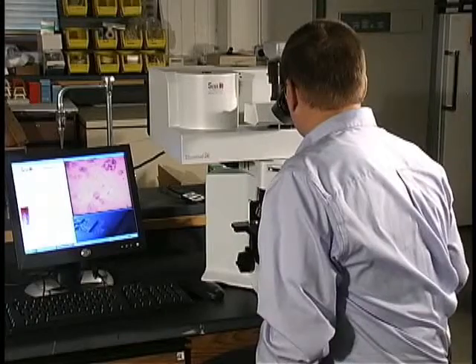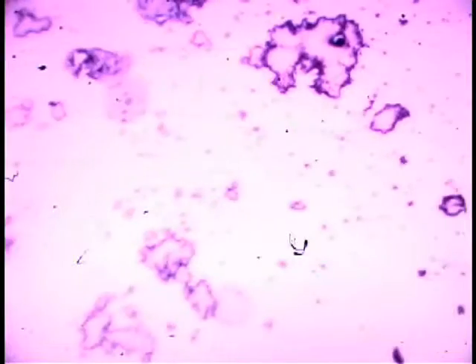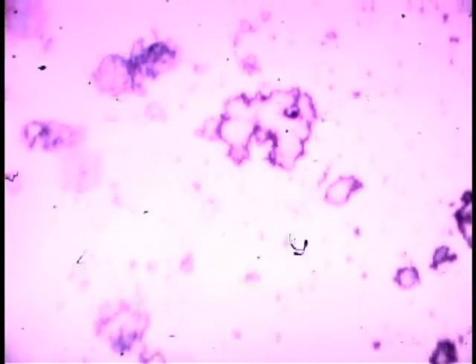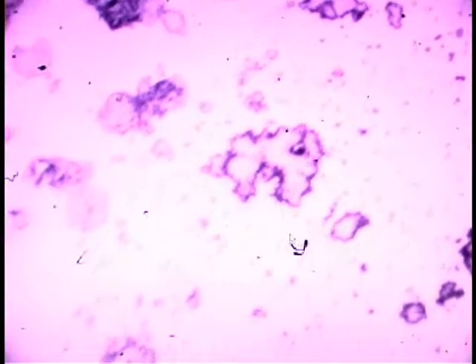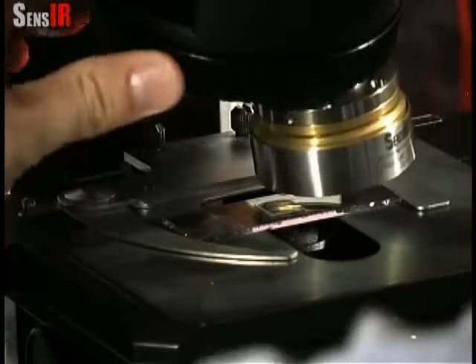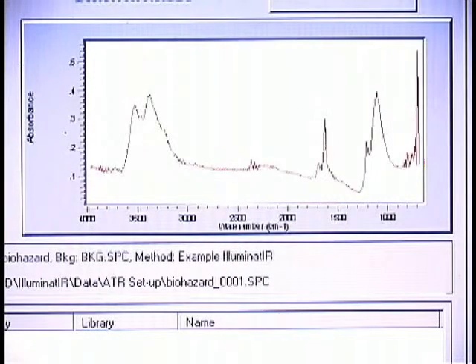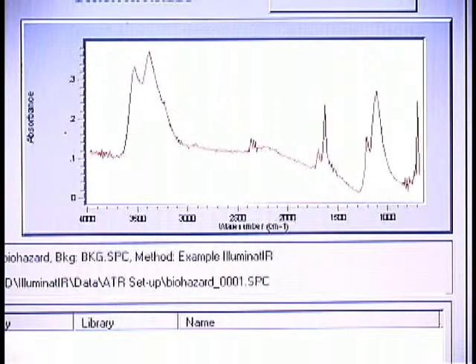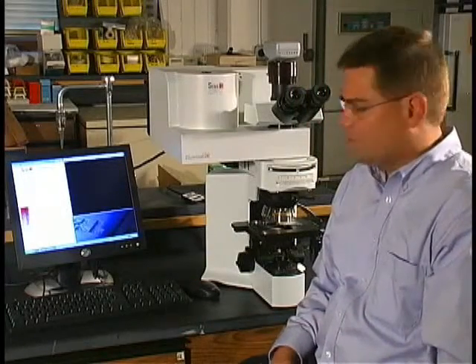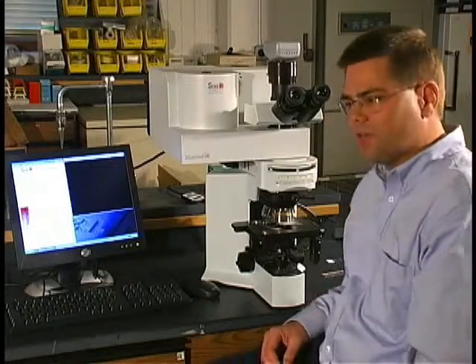I search around, looking for the different particles that make up this two-component mixture. I then center an area that I would like to analyze in the field of view, rotate in the infrared objective, and collect the data. After collecting the data of the first particle, I then move to other particles in the cell to characterize those.